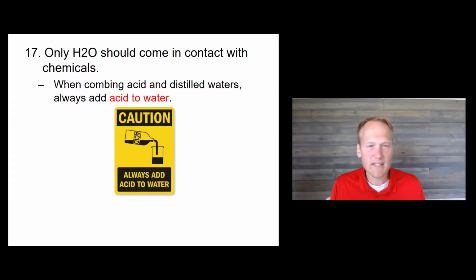We are never going to mix chemicals together unless I instruct you to. The only thing you would ever mix together would be water, and that'd be to dilute something or to create a solution of something. I typically am the one who makes the acid solutions, and when you do that, you always pour the acid into the water.